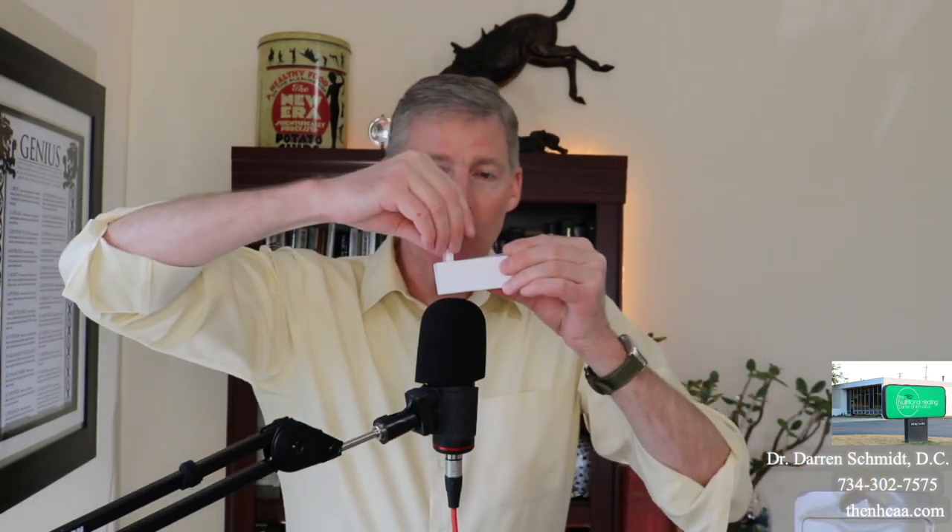This product is called Glypho Check. It measures glyphosate, which is Roundup, in food, water, and urine. It comes with two kits in one package. When you open it up, it has an instruction sheet. Follow this — if you want to measure glyphosate in your honey, beer, cereal, or water, follow those specific instructions. When you test your urine, it comes with a series of vials, including a very small one.